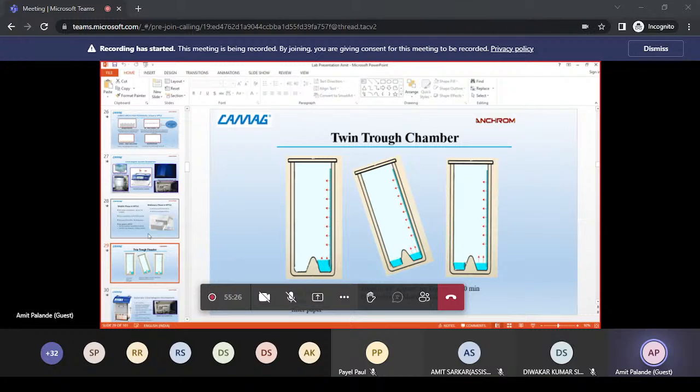Like this, as I told you, there is an AMD2 also, automatic multiple development. This is mostly used in research work or R&D work. Here in this AMD2, there are 5 bottles, and you can fill them with different solvents, from polar to non-polar and medium polar, and then you can decide till what distance you have to develop with which solvent. So you can do multiple development in the same direction with different mobile phases.